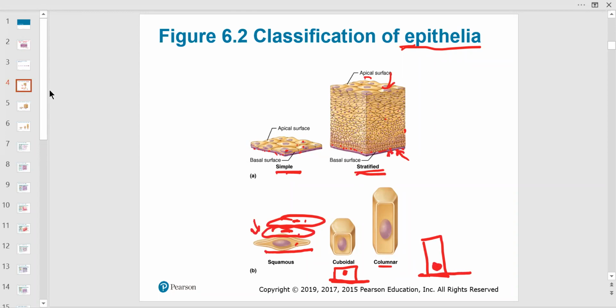So when you look at the cells, you'll see one layer. This is simple columnar epithelium. So you can try to look for the nucleus. There's one nucleus. Here's the membrane. And don't forget the cell membrane too. You could see that in histology in the microscope. And maybe you guys saw that when you looked at the starfish or the whitefish and the onion cell, which the onion has a cell wall, but we have plasma membranes.